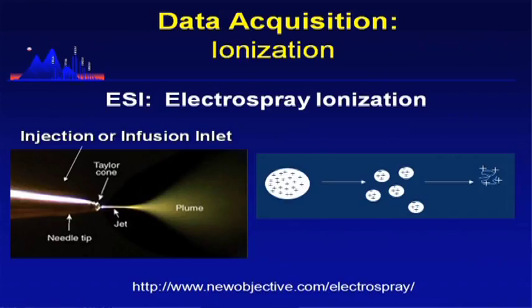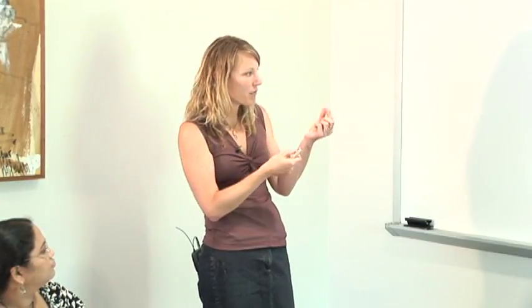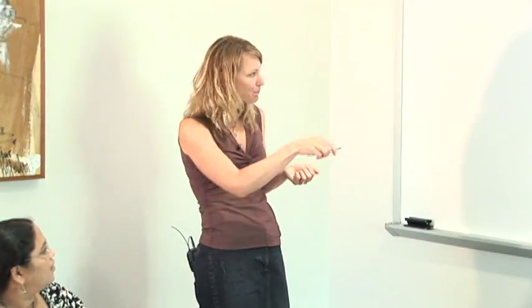Electrospray ionization is our other type of soft ionization. In this case, again, we're doing liquid phase, so most likely we've got an HPLC out here. Then our liquid that contains our peptides is flowing through this little tip. These are really small. Nicole will show you a little video where you can see the little tips. They're really, really small, like hairs, and it's pulled fused silica, actually. The tip is very fine, generally about maybe 30 microns in diameter.